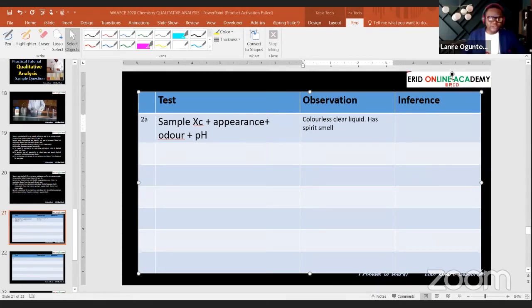Okay, so let's talk straight about the pH of this particular propan-1-ol. We have said that it's a colorless liquid, and our focus is the pH of the solution of this alcohol. You wouldn't expect your alcohol to be an acidic substance, right?